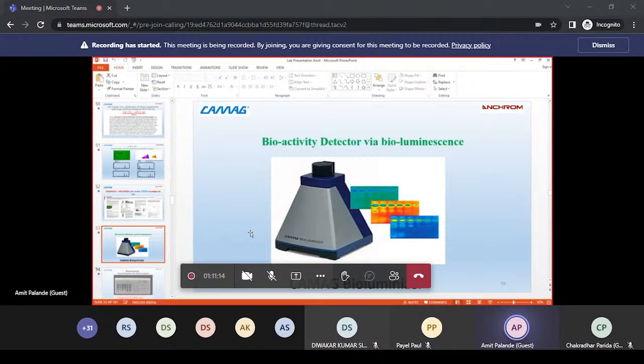Mostly we use Aliivibrio fischeri because it is very safe to handle, and when there are healthy colonies of these bacteria in your sample, they stay alive on the plates and emit light, or bioluminescence. They are very sensitive to even minute levels of toxicity, and that is why we mostly use Aliivibrio fischeri. This is one fingerprint of a wastewater sample.